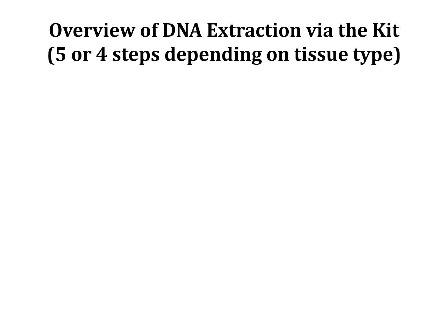All right, guys. So how does this kit work? As I said, we need to purify this DNA. It's still stuck to the filter. So let us just go back a little bit. DNA extraction using this kit has 4 steps, 4 steps if it doesn't have a cell wall. If your cells don't have a cell wall, we go with 4 steps. If it has a cell wall, we go for the 5th step.